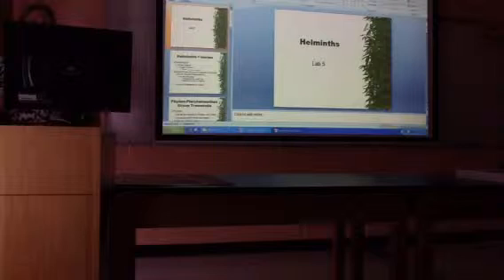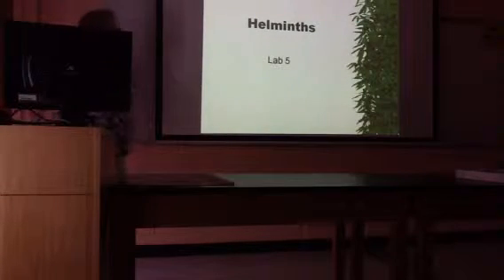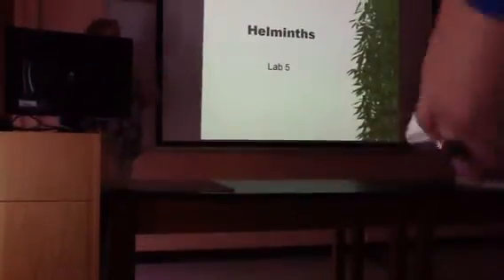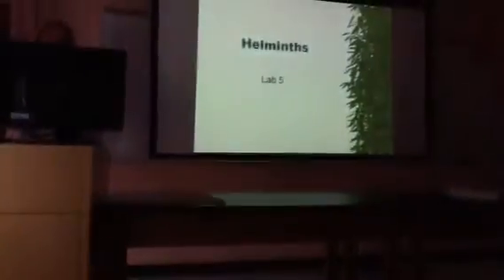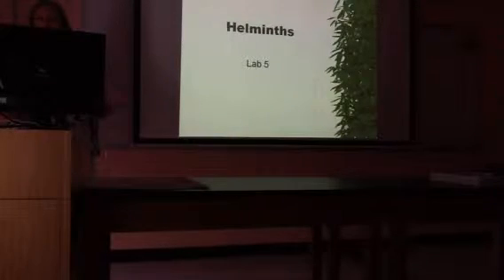All right. Lab 5. Lab 5 for worms. Helminth is a scientific term that just means worm. It's not the name of any kind of group or kingdom. It's just a word that means worm.